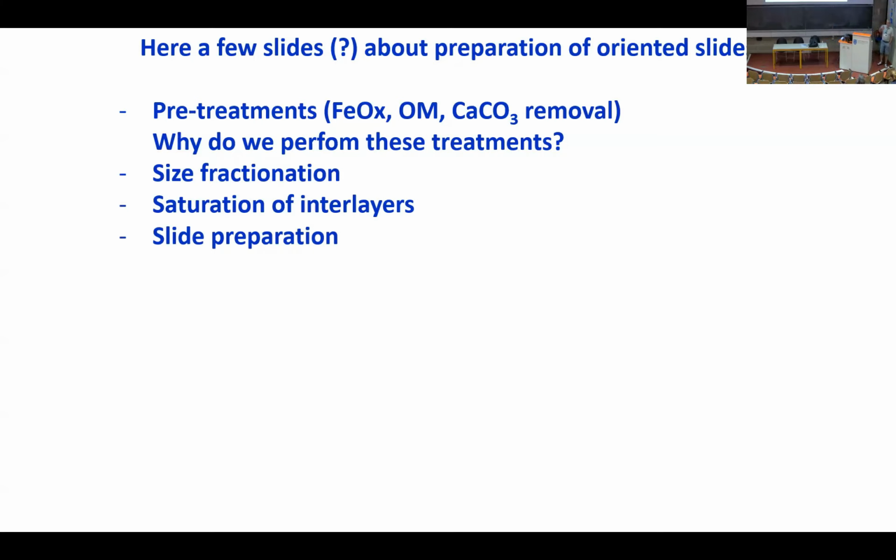So I'm not saying you should not try to remove iron oxide, but maybe now we have ways to remove iron fluorescence without losing too much intensity. One example is to use an energy resolved detector. In this case, you're just counting the good photons and nothing else, but you're counting all of them. You don't have a filter where you will lose 50% of your intensity. You will be able to measure all diffracted intensity from your sample, but nothing else.